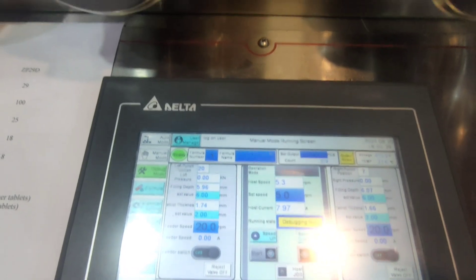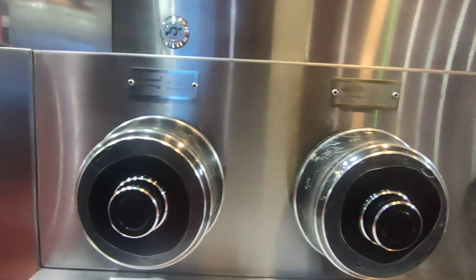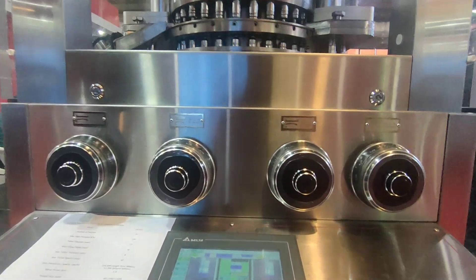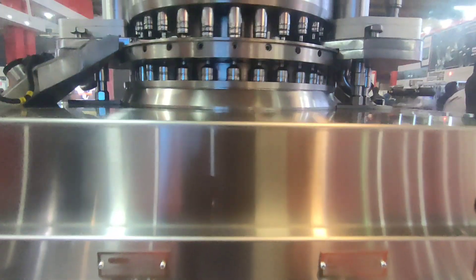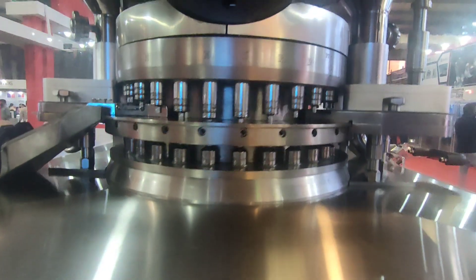These are the weight and hardness adjustment controllers — two for weight and two for hardness. The main revolving component is known as the turret of the compression machine. Here we have the upper main compression pressure wheel.